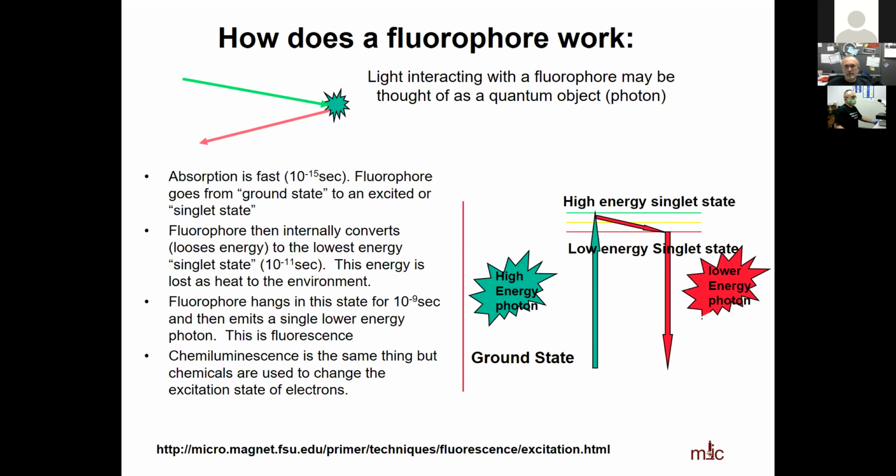And that brings that molecule from the ground state to the higher energy state, and there it will lose some of that energy, and then it sits in this excited singlet state until it can emit a photon, and this is where we get fluorescence. But a lot of times we don't get a photon. Maybe the energy is used in a chemical reaction or transferred to another molecule, and unfortunately for us, no signal.